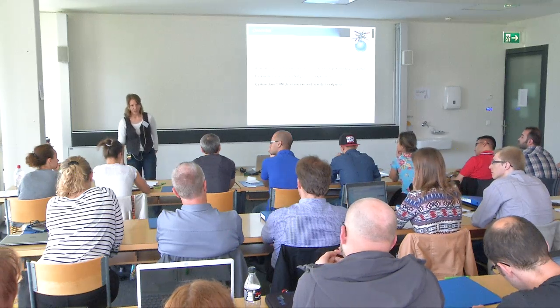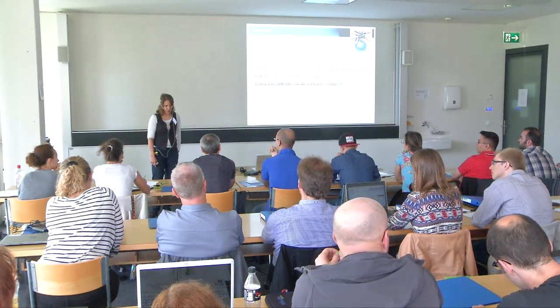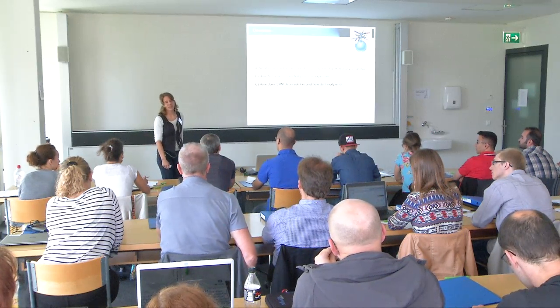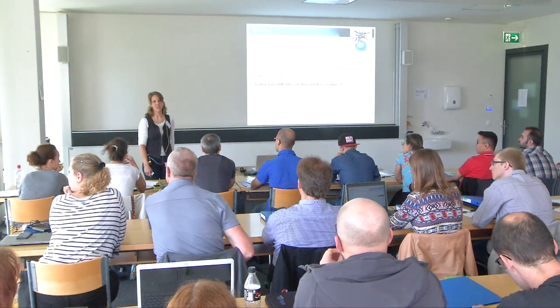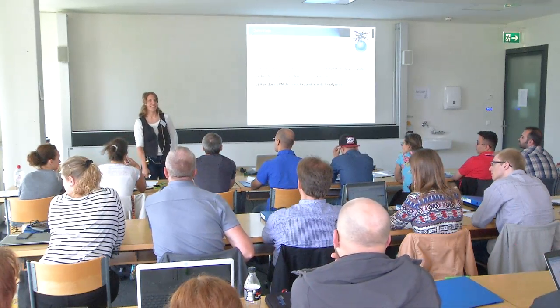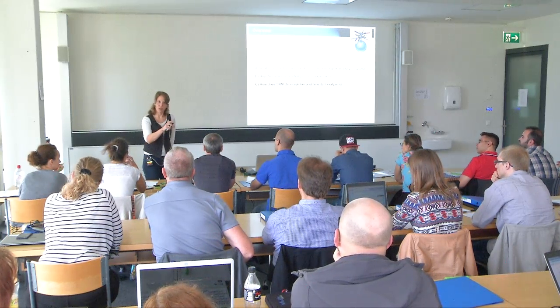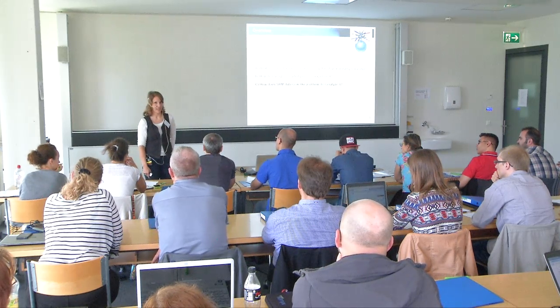Well, it's a very good question, and actually I removed this slide from here. Usually it was always on there. So there are different ways to define uniqueness, obviously, and the way they do it, they just take the protein sequence of a whole proteome, right? Take the gene and translate it. They take all the open reading frames. This is what they use as the protein sequence, and they just search peptide uniqueness according to this.